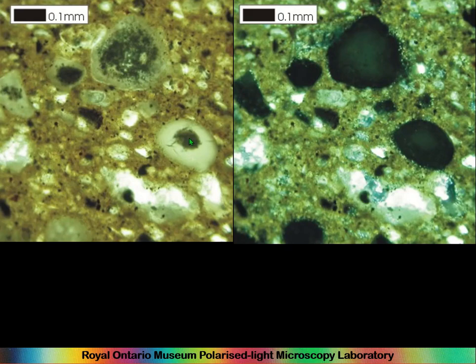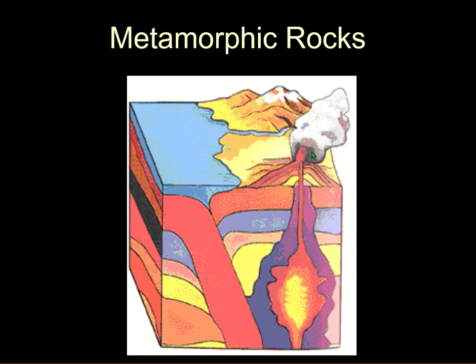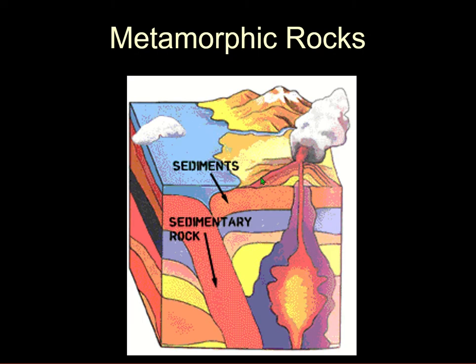Oh, and as I said, also ooids. These look like ooids of phosphate, again, in a piece of pottery. They've probably been weathered out of their host rock and become aplastics in the clay. So finally, metamorphic rocks.